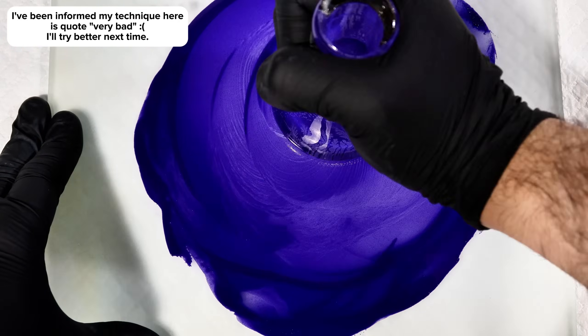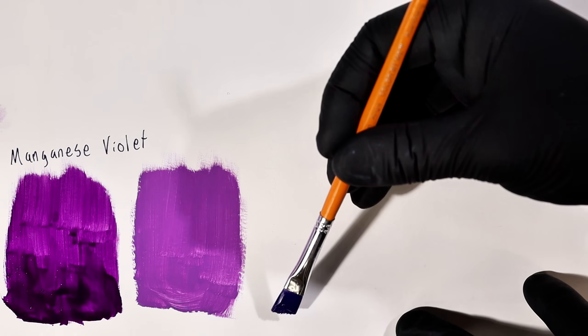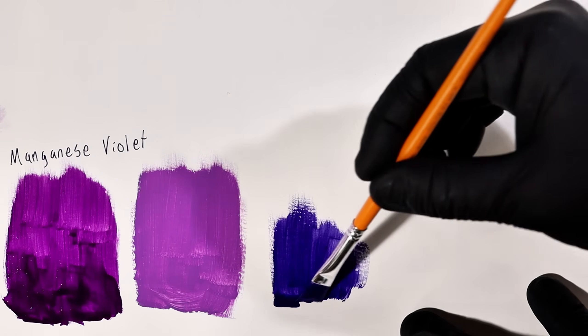I then went ahead and swatched my new violet paint directly onto a piece of paper that I'd pre-treated with gesso. You can also see here that I'd previously swatched some manganese violet, and I'll have a video for how to make that pigment coming out within the next couple of weeks. Hopefully.